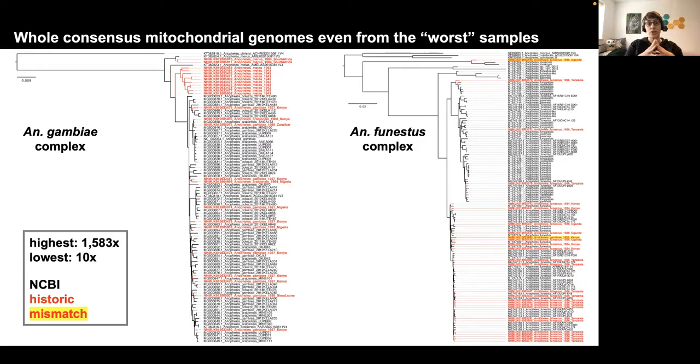And this showcases the power of this whole approach to just barcode, mitogenomically, so mitochondrially barcode, pinned-dried insect collections.